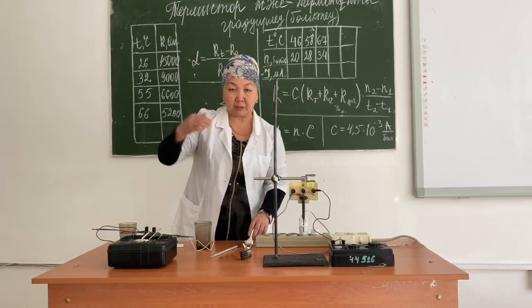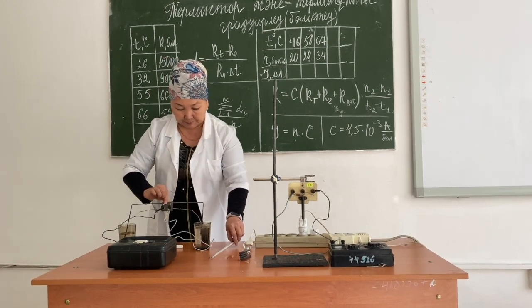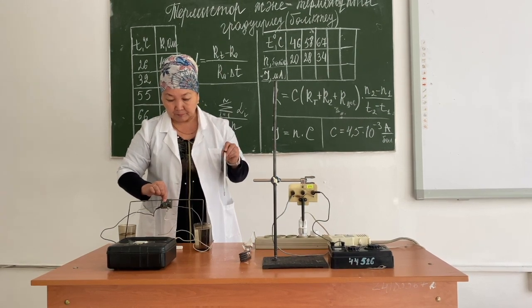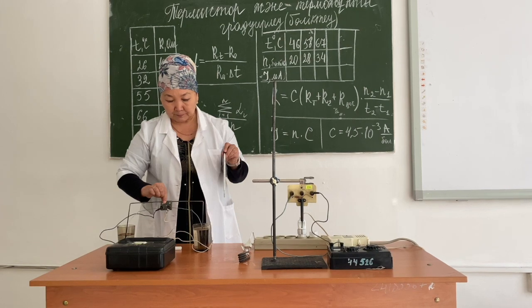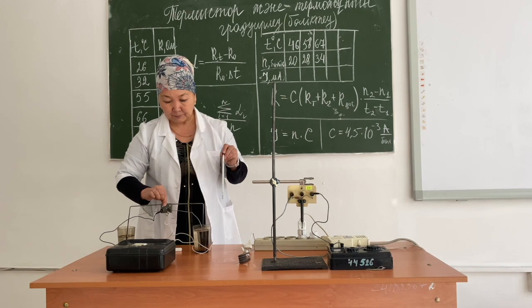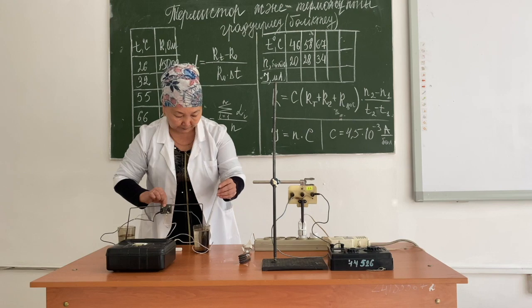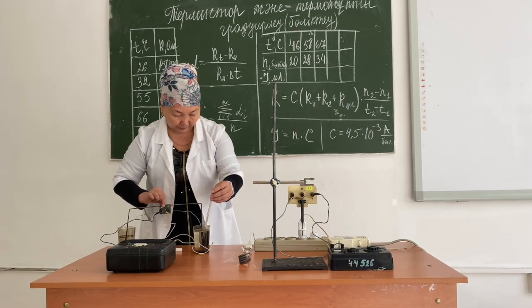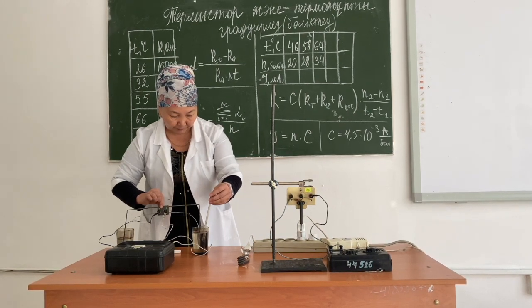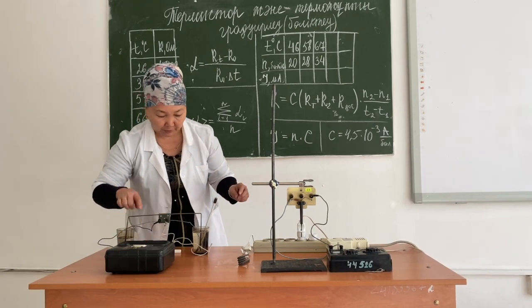The second advantage of the thermocouple is the ability to measure temperature from a distance. At a temperature of 80 degrees Celsius above zero, the number of divisions is 45.